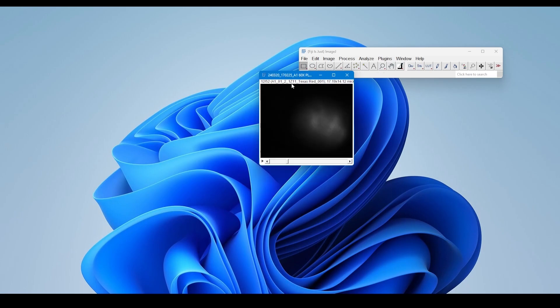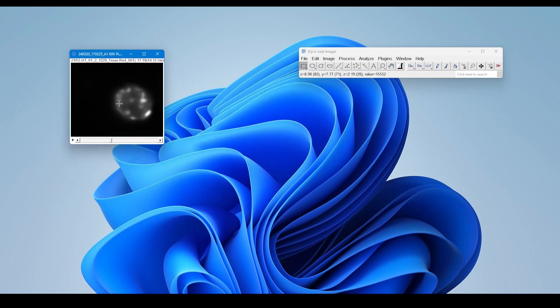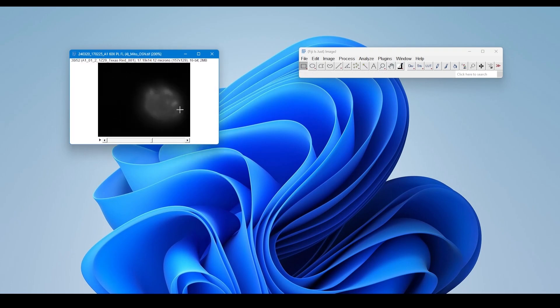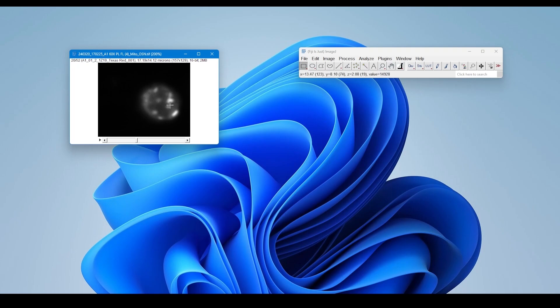What I've done here is I've cropped my cells to make my analysis semi-single cell-based. As I'm panning up and down you can see the shapes of mitochondria and they look pretty close to being round. But because this is a 3D Z-stack, we ought to be able to analyze this in 3D before making a conclusion about the exact nature of mitochondria shape.